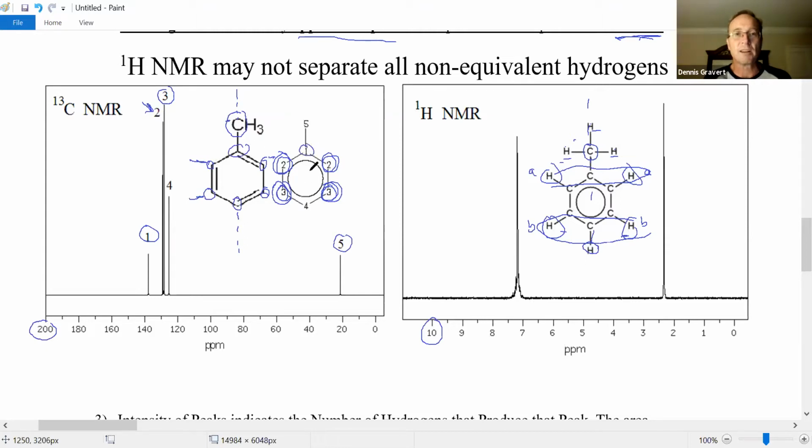Wait, I got 1 here. 4 is down here, sorry. Hey, bottom line is there's one carbon producing this peak, but look, it's twice as big as the other. It's not 2 carbons because it's twice the height. No, carbon NMR intensities are not reliable. It's suggestive though. The biggest peaks contained equivalent carbons. There's 2 carbons producing each of these peaks, but there's only 1 carbon producing this one, even though it's twice as big as that.